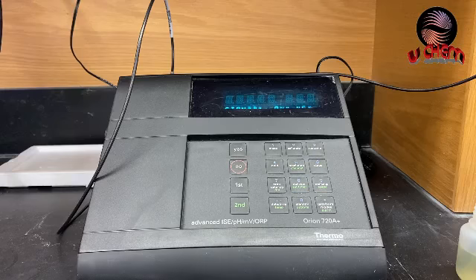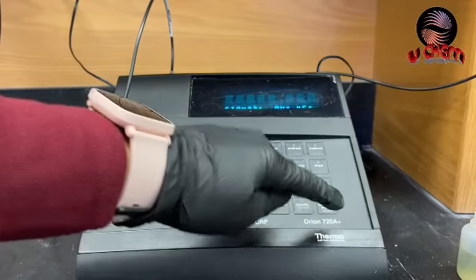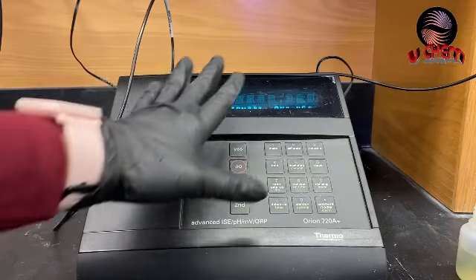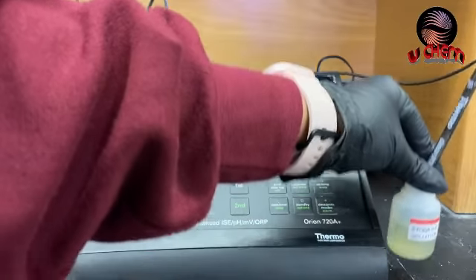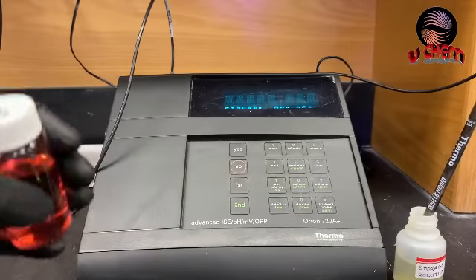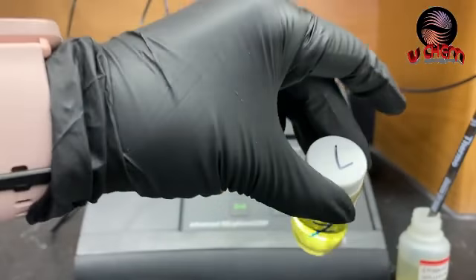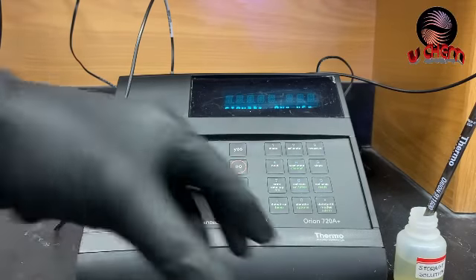Today I'm using the Orion 720A Plus from Thermo Scientific. Here I have the meter where you get the readings, and here I have the probe that's dipped in the storage solution. I'm going to do a three-point calibration where you have to use three buffer solutions — pH 4, pH 7, and pH 10.